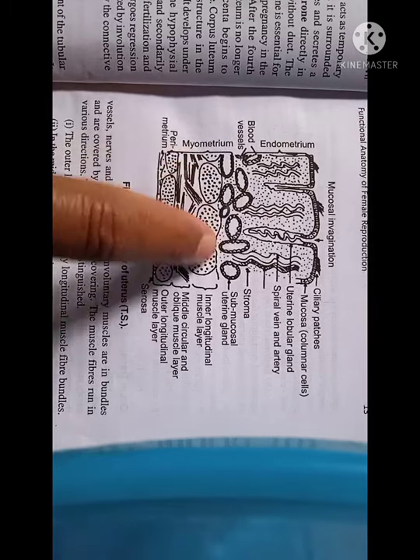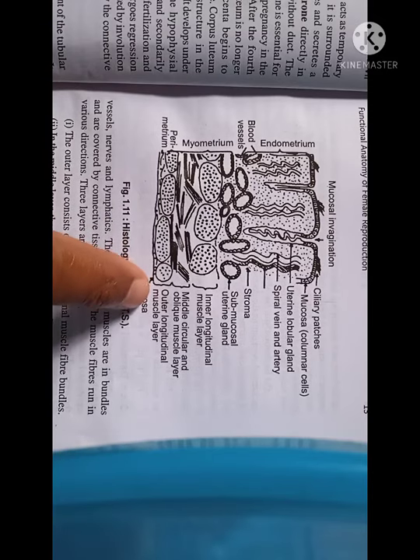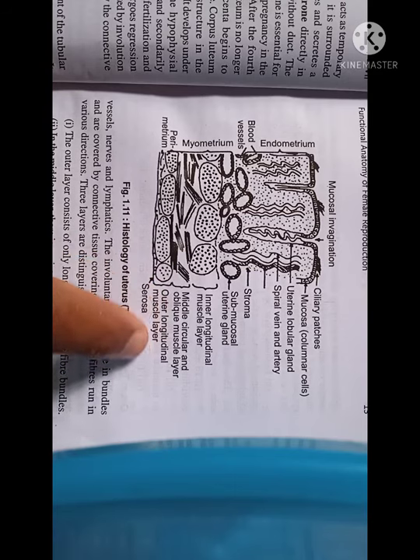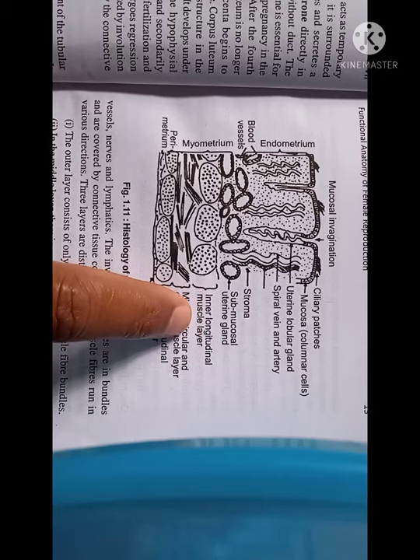The second one is the myometrium. It is the middle layer, the muscular layer. By contraction of this layer the baby is expelled out during parturition. It consists of bundles of smooth muscles along with connective tissues. You see here the longitudinal muscle layer, this is the middle circular muscle layer, and the inner is the longitudinal muscle layer.